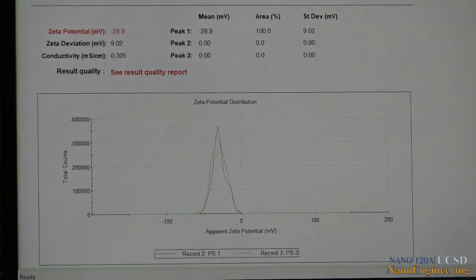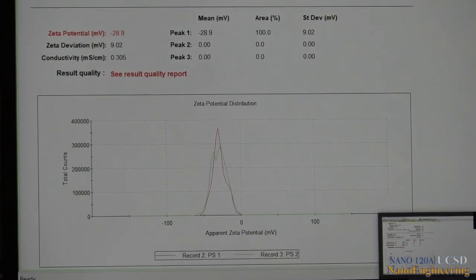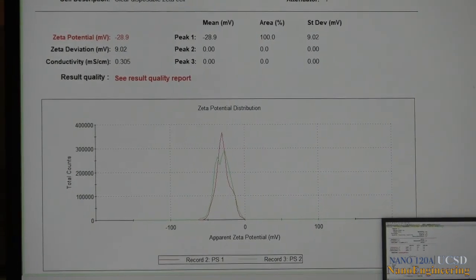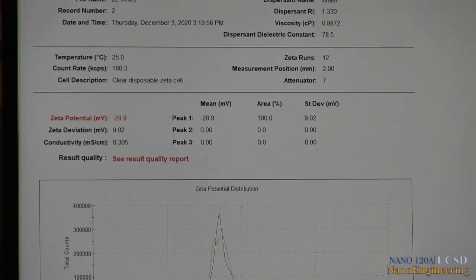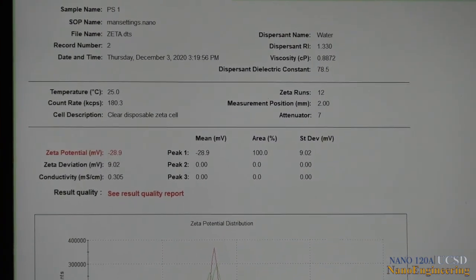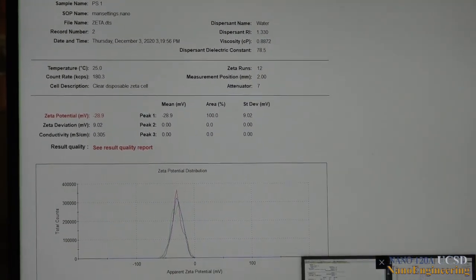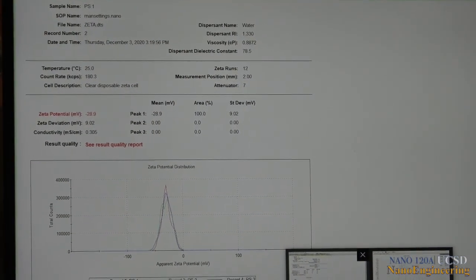Okay. So quick and easy. I'm hoping this is going to be quick and easy for you as you dial into this instrument. Someone is going to be here changing out the samples. So it's either going to be via Zoom or via a text message or something when you say, okay, switch the sample. And either me or one of the TAs will switch the sample over. But I hope this is a good experience for you, and I think it's a good learning opportunity.